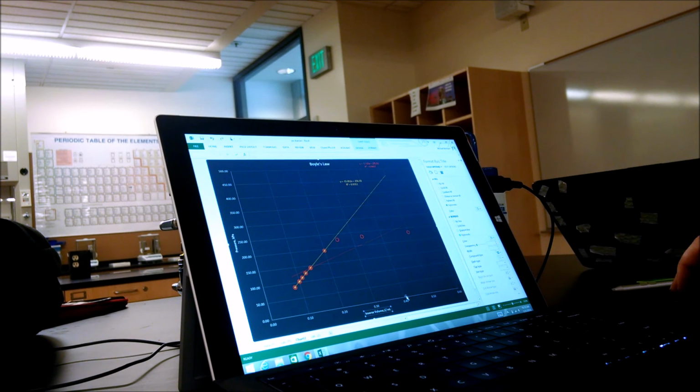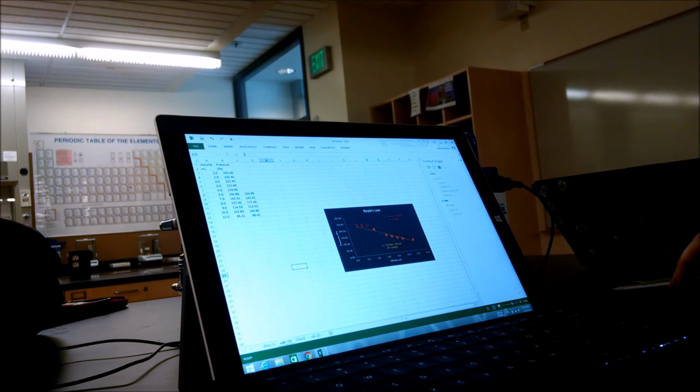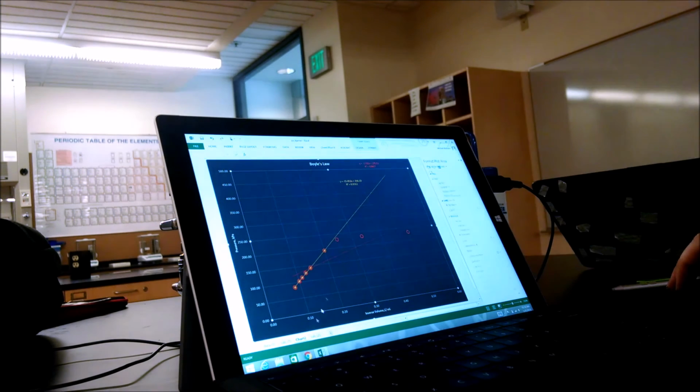In Calc 2, inspect and confirm the trendline equations in Calc 2 and Calc 1 are different. Oh, it's because it's a bug. Sometimes it hangs sort of. So Calc 1, it's like 17 and 0.96, 15.93, so 17 point, yeah, see they didn't change.